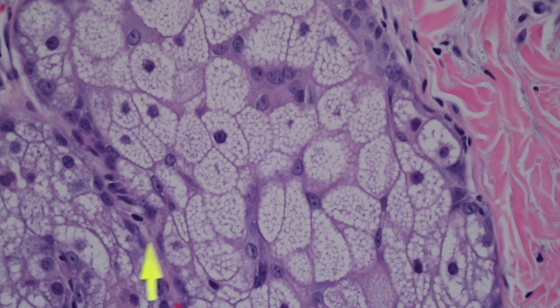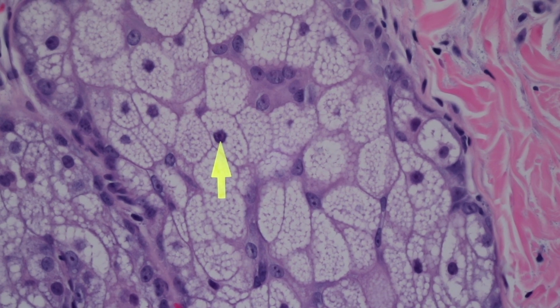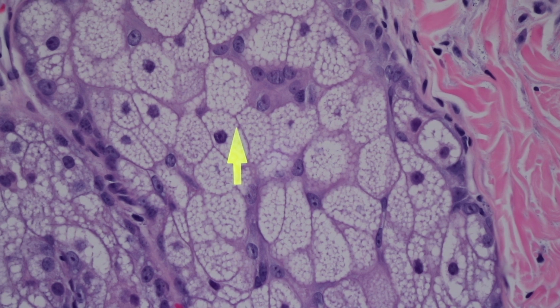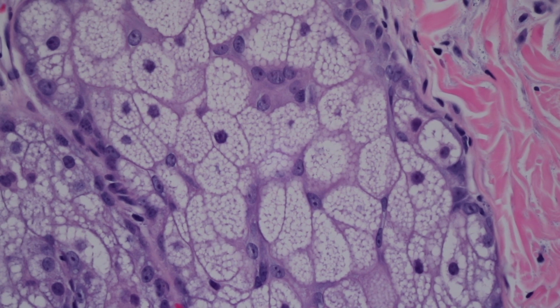So each cell, here's one whole cell. This one right here is one cell. It's got a nucleus, the little purple thing, and then all of the cytoplasm is completely filled up with these tiny little white bubbles. And these are perfectly round because these were fat, and the human body is made up of water, and when you mix oil or fat with water, what does it do? It makes perfectly round little droplets, little spheres.